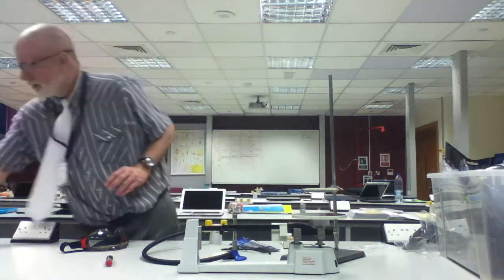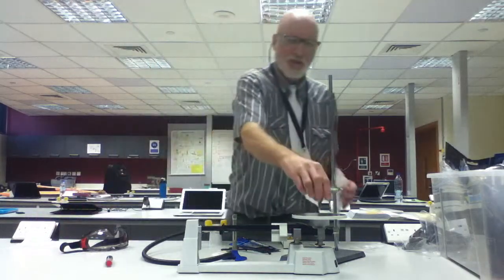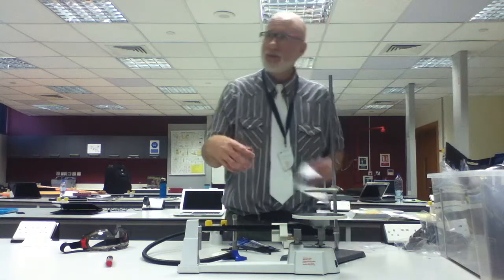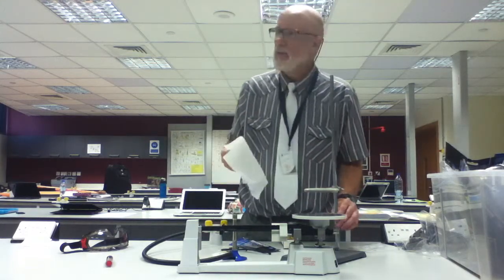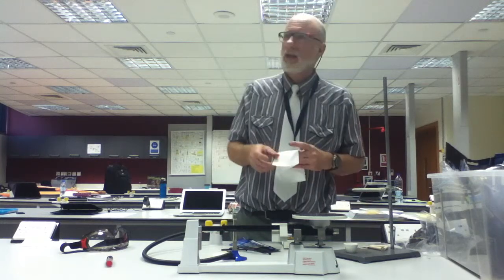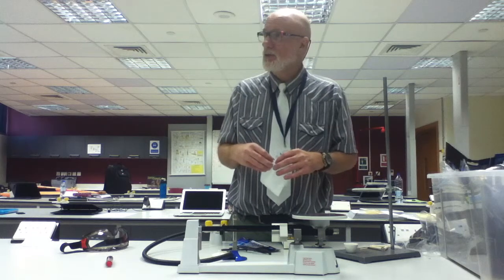Perfect. Take a piece of paper. You don't put chemicals directly on the balance. Solid chemicals, you can use a piece of paper. Other chemicals need something more durable, like plastic or a glass beaker, or you could use the crucible directly.